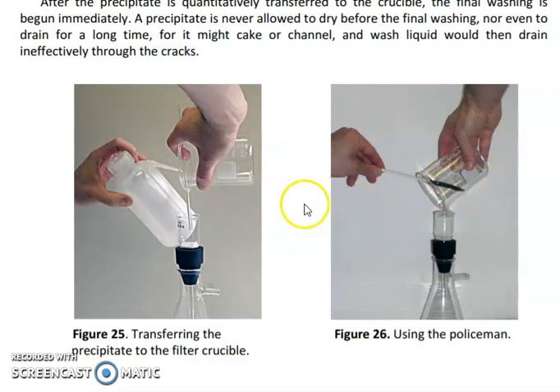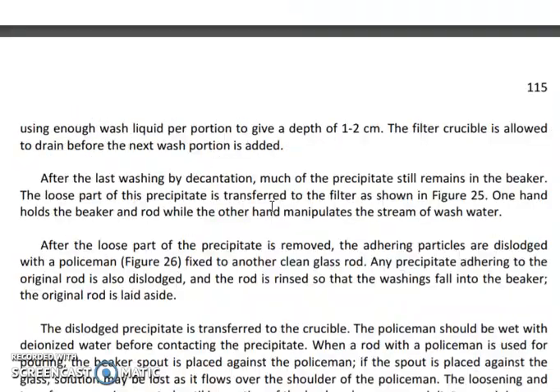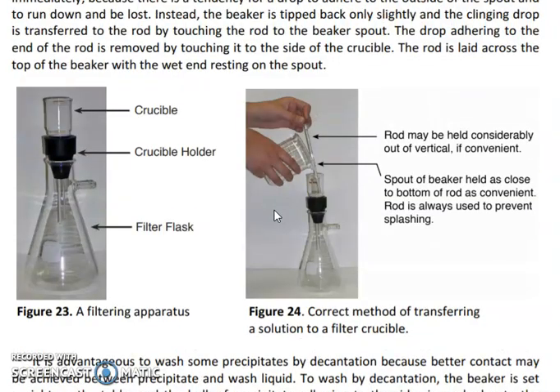This is your policeman. So my friends, I hope you take care about this method of filtration. Every time you do filtration, first you have to focus on cleaning. First you clean it properly, because if anything is there, it will destroy your compounds. So first you clean properly and then go through the proper way of handling and do the filtration, because it is not a very easy task.